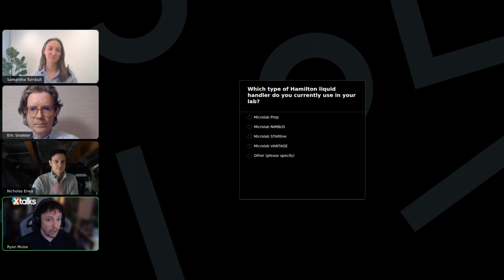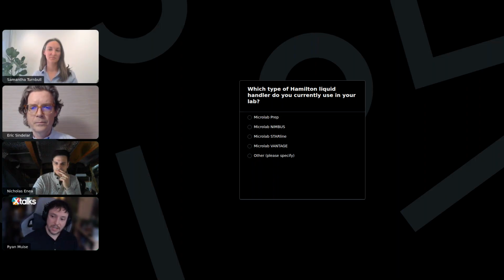Now, before we continue and hear from our first speakers, we'd first love to hear from you, our audience, with a polling question. This should be appearing on everyone's screen right now. If you're attending via GoToWebinar, you can participate by selecting any of the answers you see in front of you and then clicking Submit. The question is, which type of Hamilton liquid handler do you currently use in your lab? Your answer options are Microlab Prep, Microlab Nimbus, Microlab Starline, Microlab Vantage, or other. We'd love to hear your thoughts on the other in the questions window. I'm going to give everyone a few more seconds to consider an answer and participate.